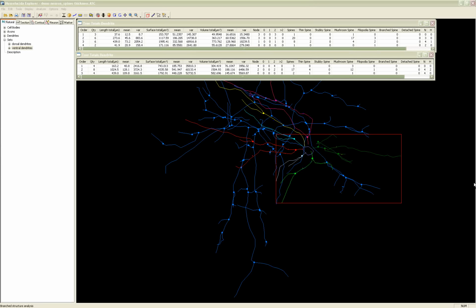So you're actually collecting data when you do that. It's not solely for visualization purposes, so you're getting a lot of data out of that. It is more time-consuming than simply placing the cursor and going through Z as you're focusing, but the reconstruction is great.